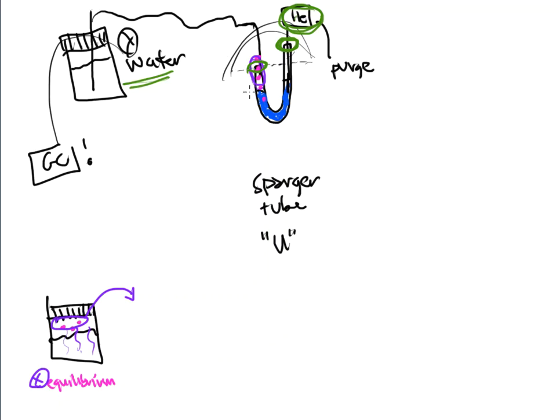You really cannot see this area unless you take the cover off, with our model at least. And where this decides to go is basically a column. I'm going to draw it as a column. It might not be the same type of column that you're thinking of if you did some other chromatography labs so far, but you can think of it as a column. And all of these volatile organics are eventually going to go on this column, and they go in here, every single one of them, and they begin to load the column up.